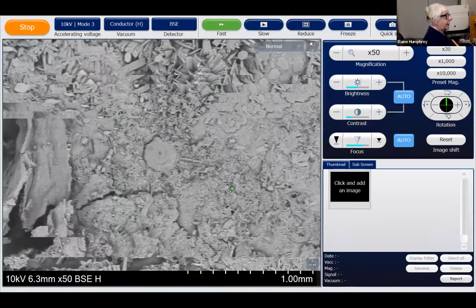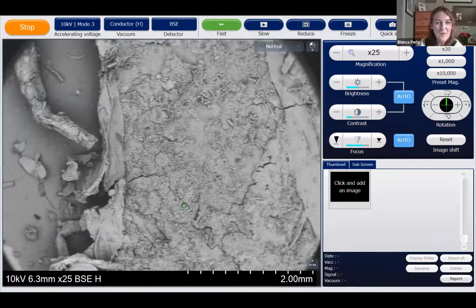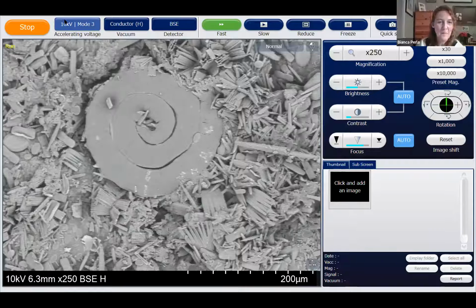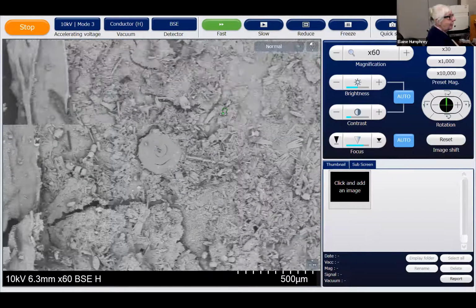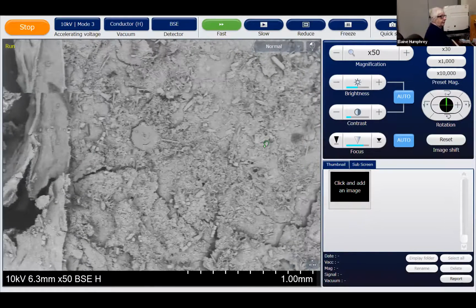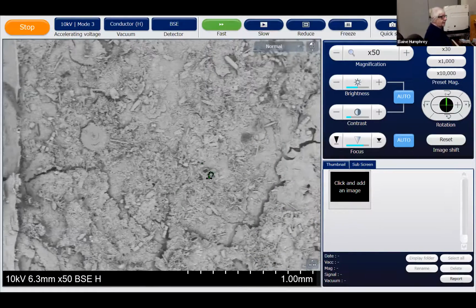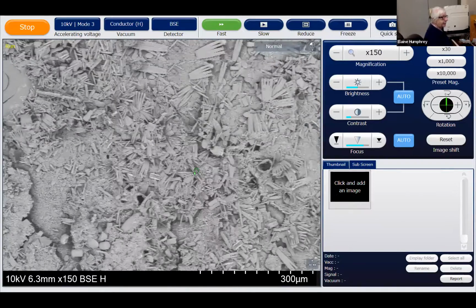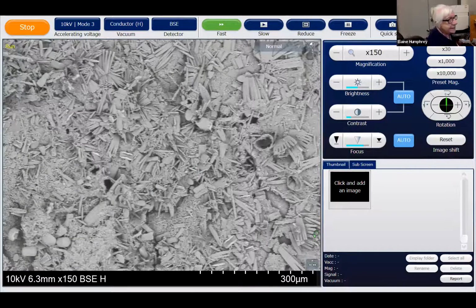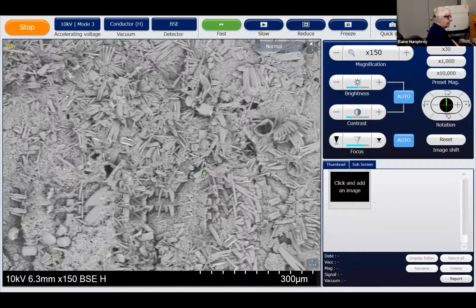So, let's go back. She got side. What was that in the middle there that was curled around? Did you say? It's a worm. Okay. An annelid. Another annelid worm. Another annelid. Yeah. And you'll notice as well here, see these little black specks? These are tintinid mouths. So this tintinid over here, can we look inside the mouth? We'll have a look, try and see.